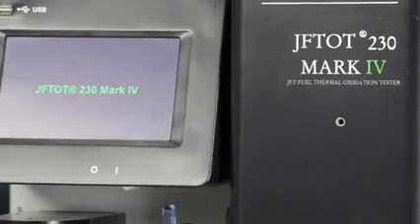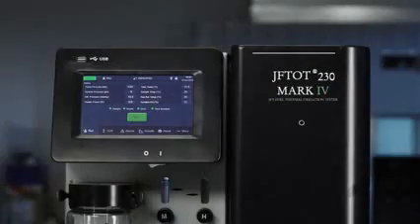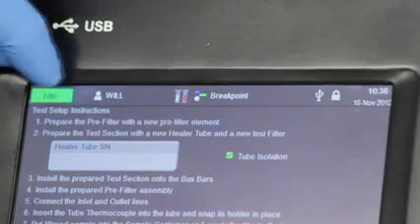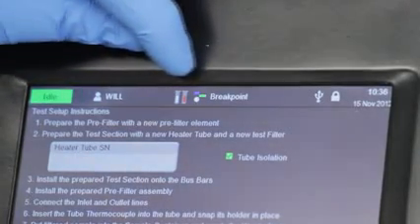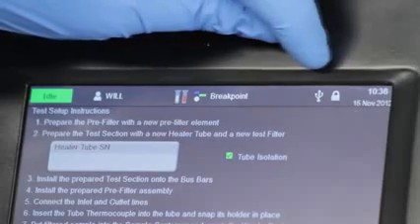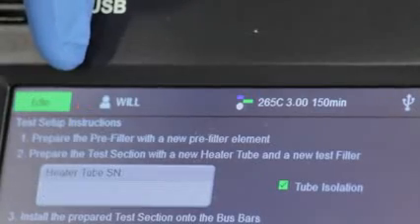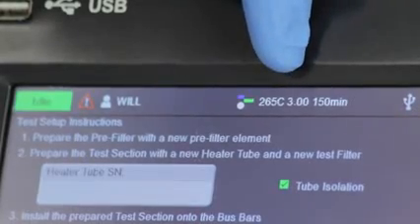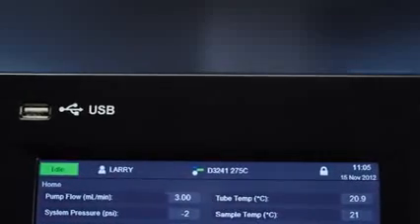After you press the power button, the first screen you'll see is the home screen. If you look at the top of the screen, you'll see the status bar. You'll be able to see the status bar on every page. It shows the current status of important information like the instrument state, alarm indicator, username, method name, activated external connections such as Ethernet or USB.